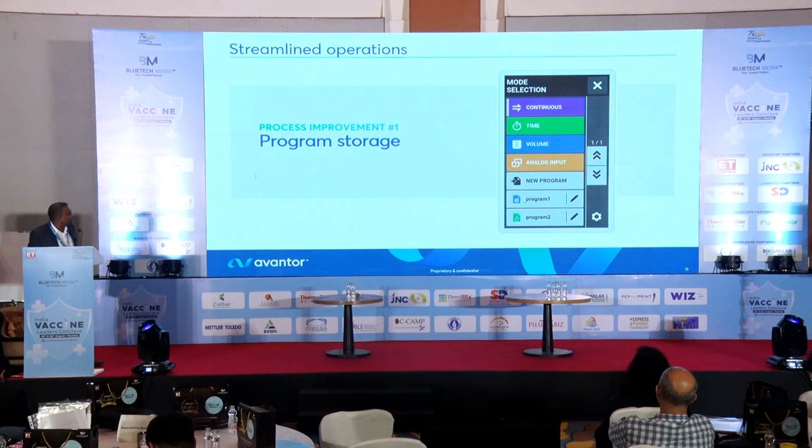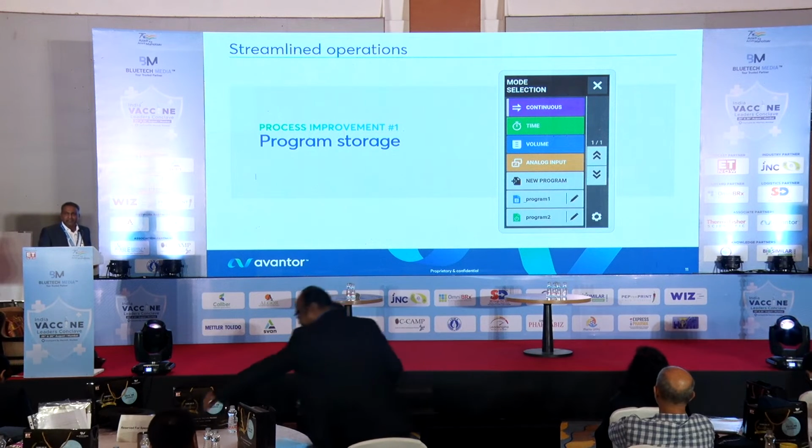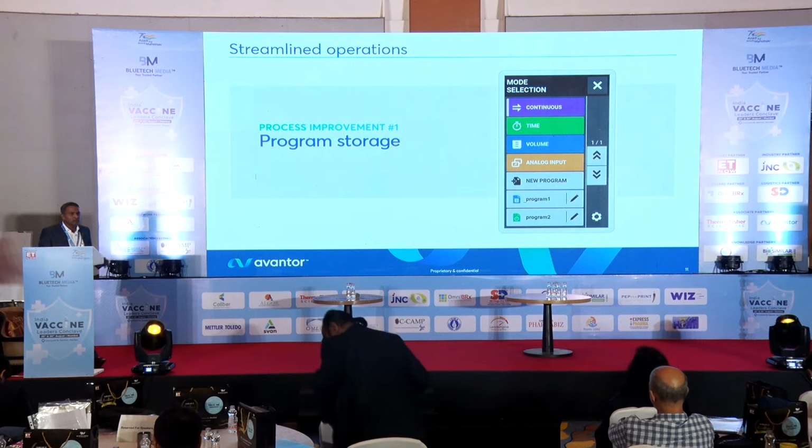So what tool or process improvement can they use? The first process improvement is program storage. Now, what is the major new thing here? If you are setting the program manually, it takes a huge amount of time for all the batches.